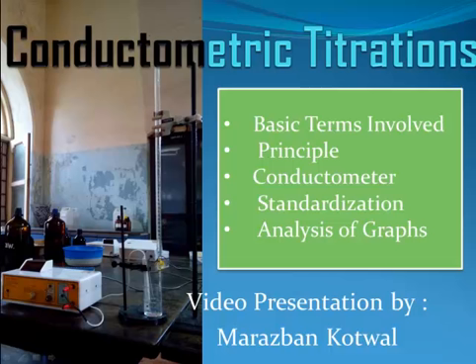Hi, in this video, I'm going to explain the method of titration of an acid versus a base using a conductometer. To start with, I'll explain some basic terms involved. Then I'll explain the principle behind a conductometric titration. Then I'll describe the construction and working of a conductometer along with the types of probes used in a conductometer.